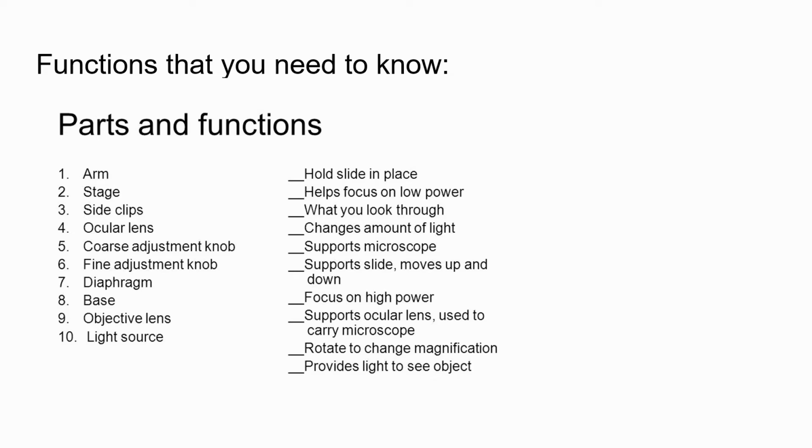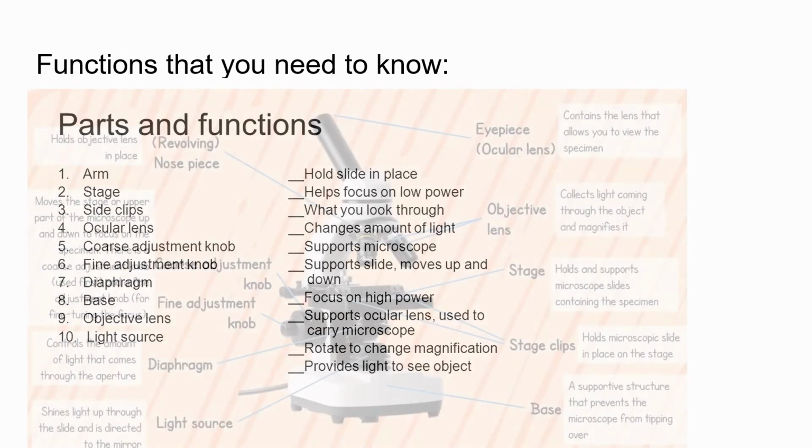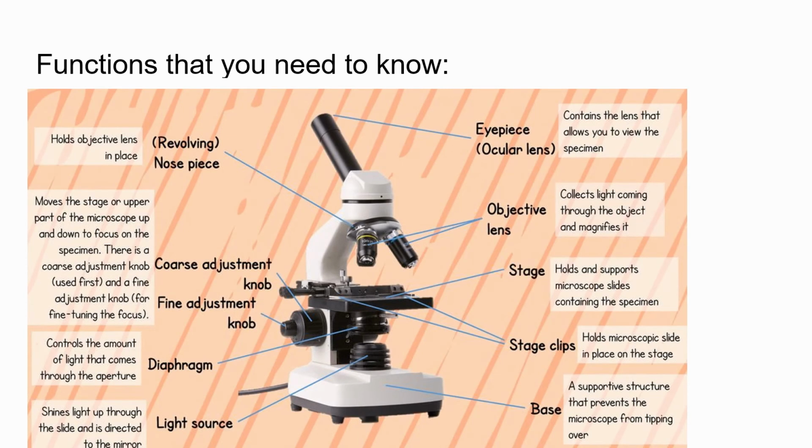Okay, I will show it now. So the nose piece holds the objective lens in place. So it's the thing that holds the lenses. And we have the eyepiece, what you look into.